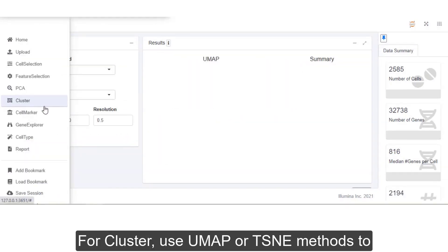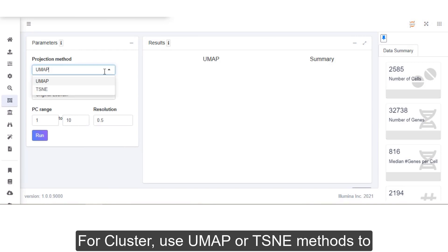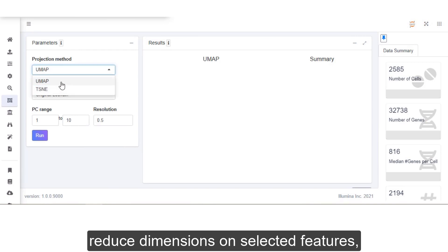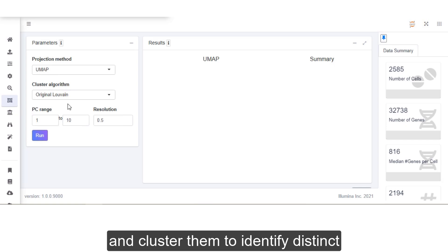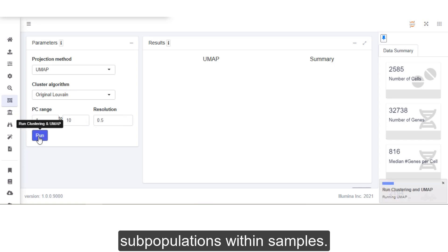For Cluster, use UMAP or TSNE methods to reduce dimensions on selected features and cluster them to identify distinct subpopulations within samples.